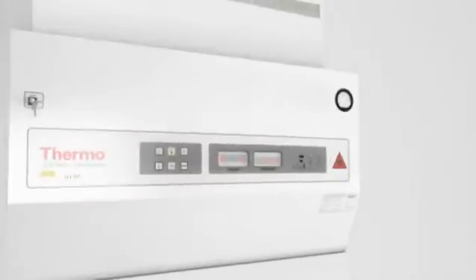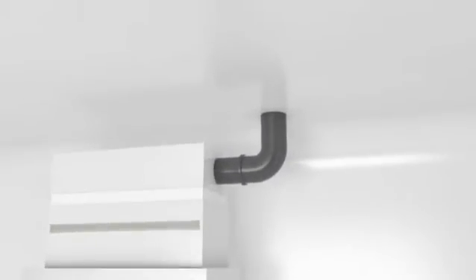HEPA filtered air from the exhaust can be re-circulated to the room or discharged to the outside of the building through a dedicated duct or through the building exhaust system.